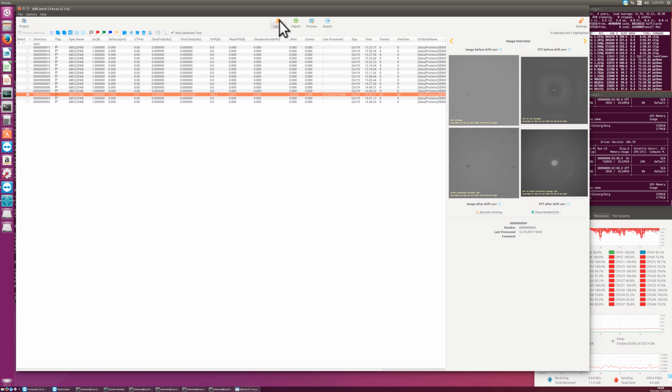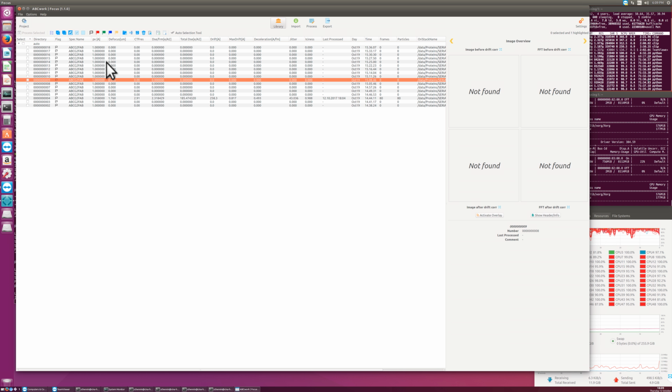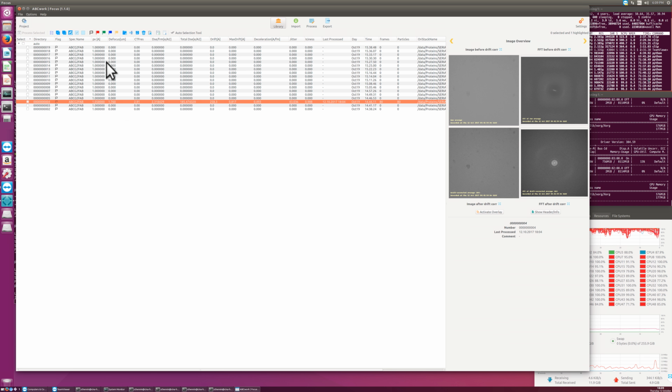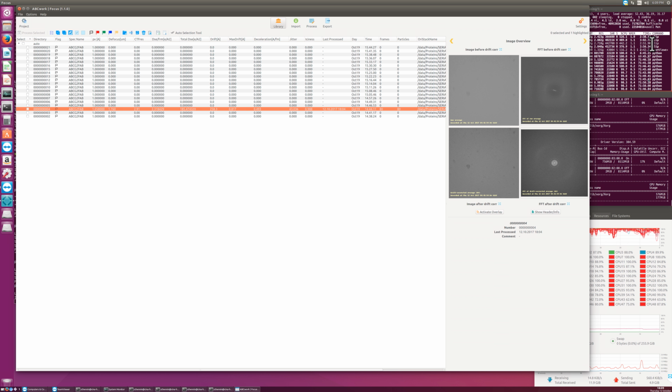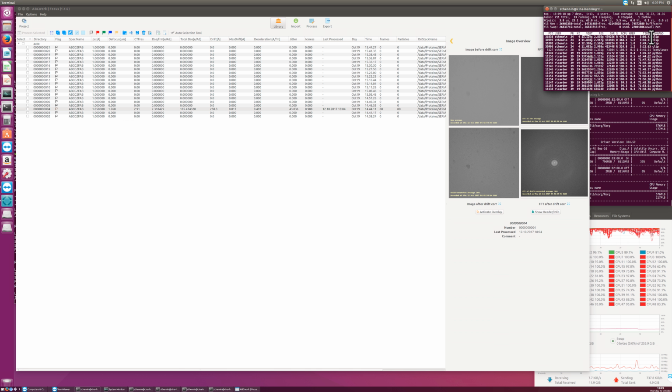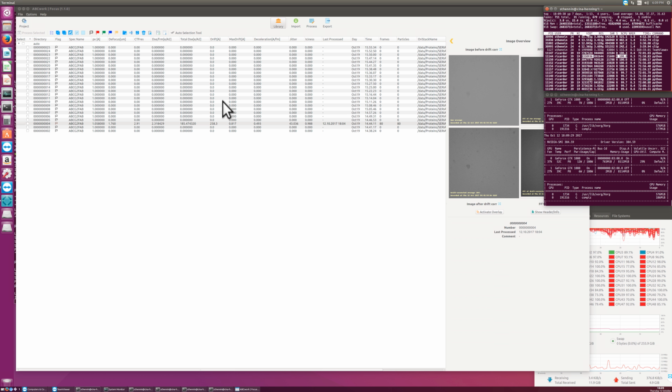And this will fill up your library. So the library at the moment is running and is processing. But we have only the one that we processed so far. The others are not yet there, but they will come. So here you can see clip is busy unpacking. The GPUs are not yet busy, so there's nothing at the GPU level, and this machine is suffering from Python jobs, at lower priority, but still. And we said 6 in parallel. Let's see how this does.